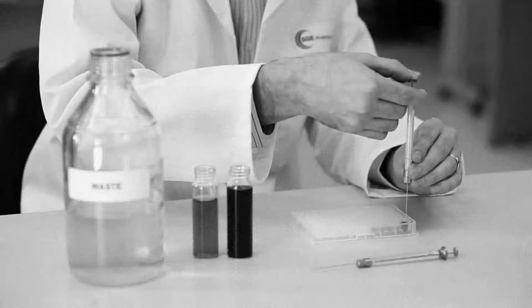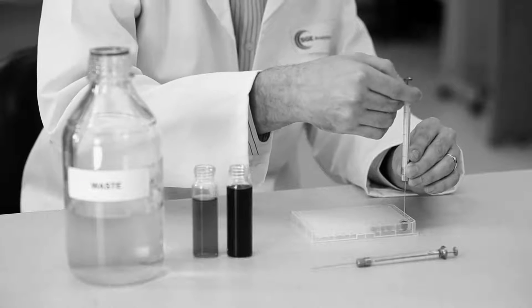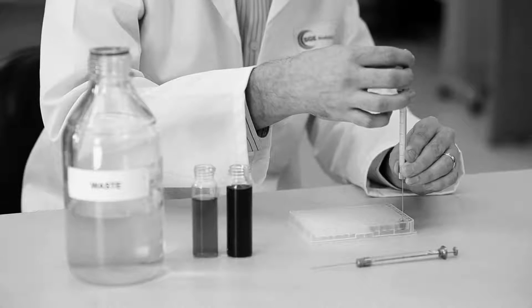While Mark has only just gotten started, the accuracy of EVOL even allows you to skip steps in a serial dilution if you only require the final volume. This is difficult to achieve with the manual syringe.